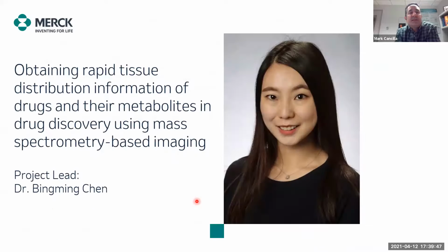All right, I'm going to completely change to the next subject, where I'm going to talk about obtaining rapid tissue distribution information of drugs and metabolites, again in that early drug discovery space, using mass spectrometry-based imaging. And I would really like to acknowledge Dr. Bingming Chen and my group, who is really the project lead for all of our label-free imaging applications.